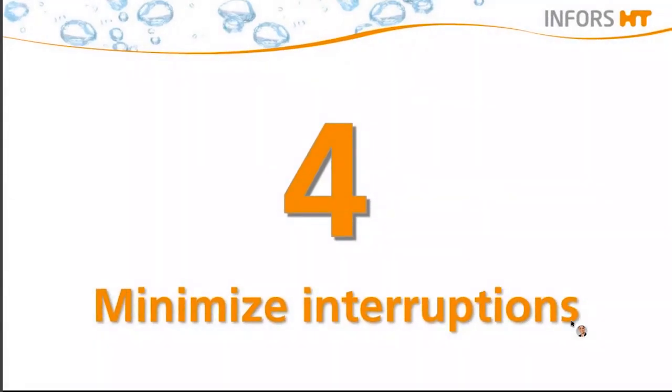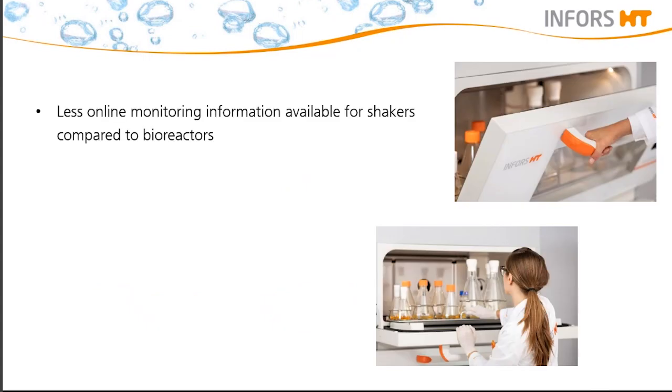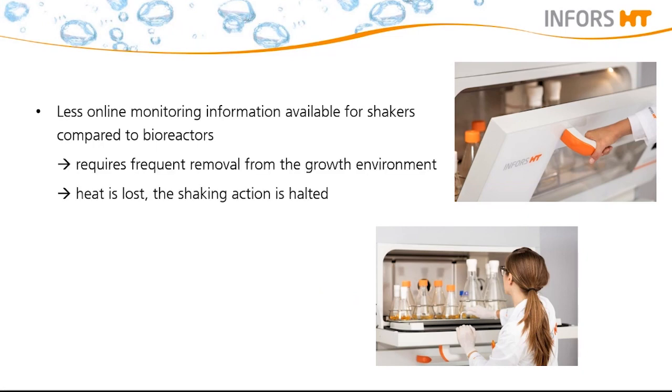So far we have explained the right throw, the speed, as well as the filling volume. But there are more influencing factors. In shakers, there is less online monitoring information available compared to bioreactors. Therefore, collecting data may require frequent removal from the growth environment. Every time the incubation shaker door is opened to access a flask, heat is lost and the shaking action is halted. Doing this occasionally will not make much difference, but you should avoid repeated door opening or taking the flask out for a longer time, as this will likely skew results and hinder optimal cell growth.